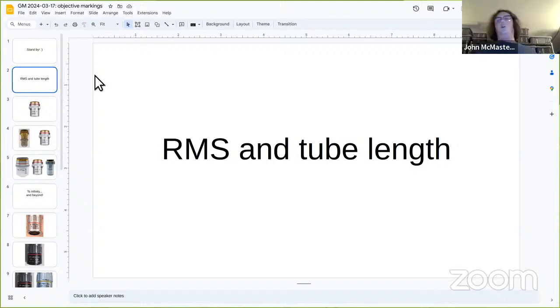And they're like, wow, wouldn't it be nice if the microscope parts that I made on my system were compatible with the microscope parts that went on your system? And so after a little back and forth, they came up with a combination of optical and mechanical standards that basically made it so if you made an objective for your system, we'll talk a little more about what that means, that'll fit together.